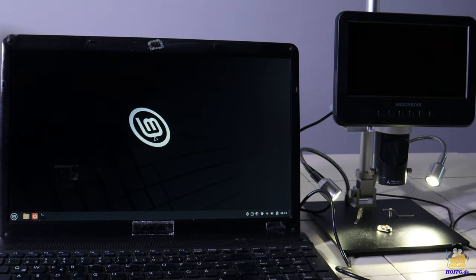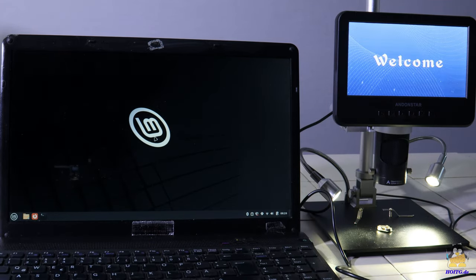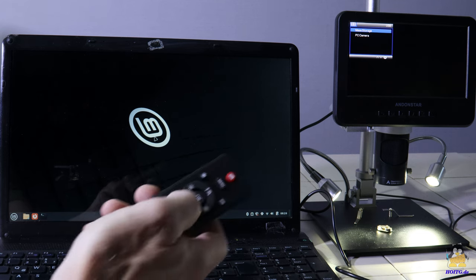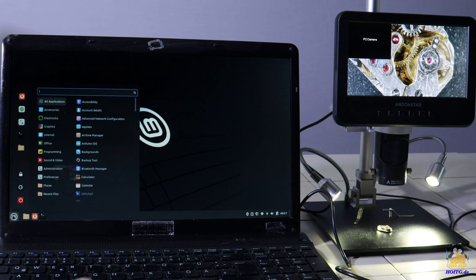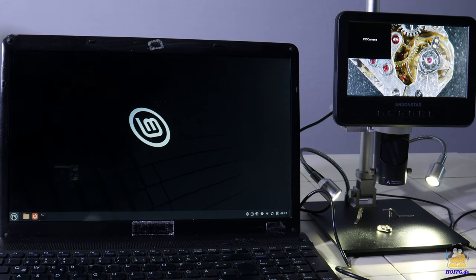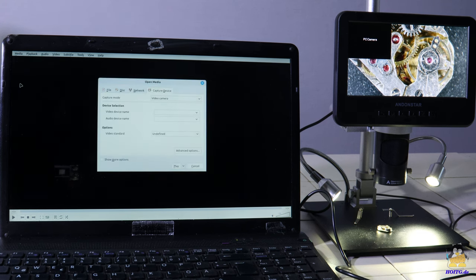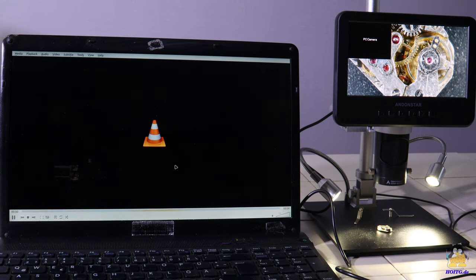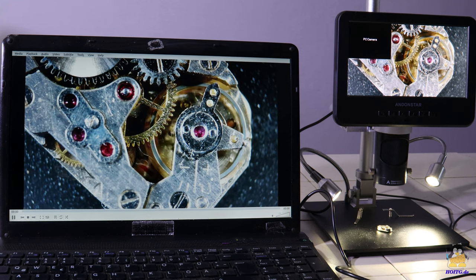The USB interface is not only used for power supply, but also allows the microscope camera to be used as a webcam via PC. Here I'm demonstrating this with VLC Media Player on Linux Mint 21.1 on my old laptop. The video stream is displayed smoothly and can be recorded if required.